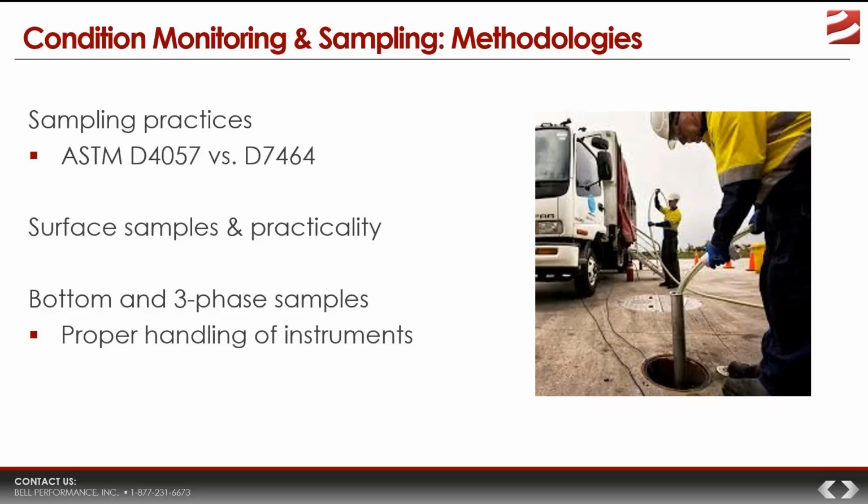7464 is the set of recommendations, the standard practice for sampling that's intended to be used to do microbiological testing and determination. So those are the two ASTM standard practices, so to speak, that cover how you should sample petroleum liquid fuel.